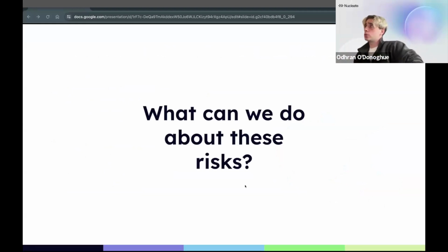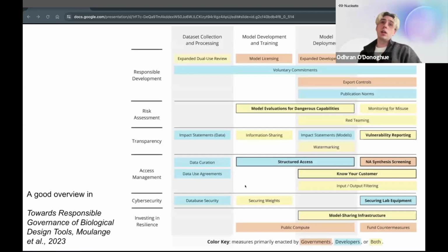There is a lot going on right now when people think about risks in biology. There is an executive order from the White House discussing some of these possible risks in AI models. There are lots of different biosecurity groups that work on this across the world. However, lab automation is maybe a little neglected area, just because it's not the current reality. Luckily, a lot of the approaches people are using in other fields are directly relevant to lab automation, so it's worth talking a little bit about these.